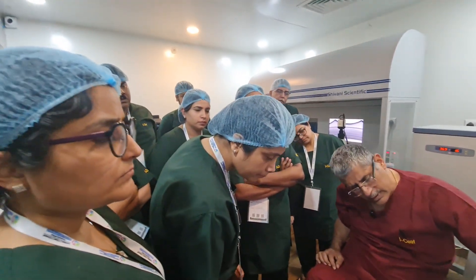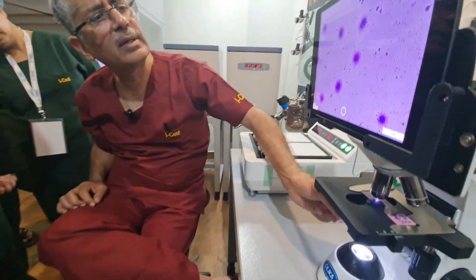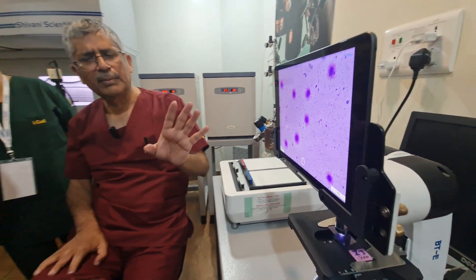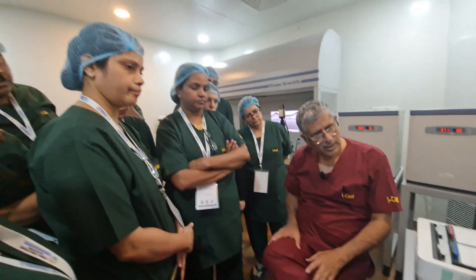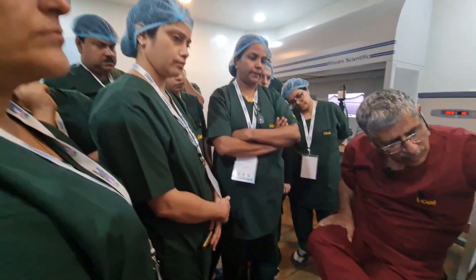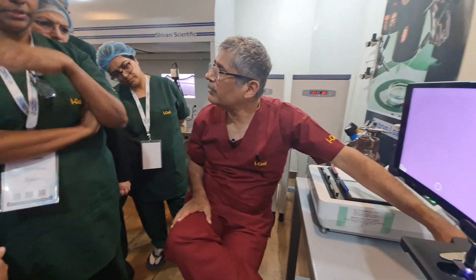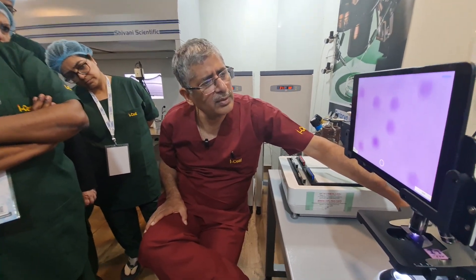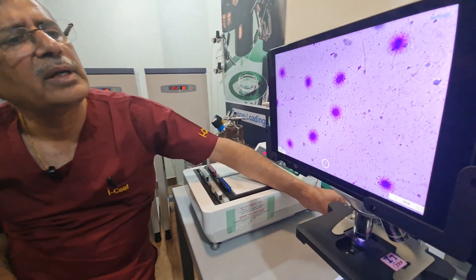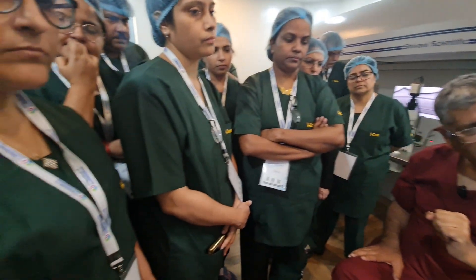You know you have to adjust, but companies will adjust and give it to you. You can also do it yourself, but don't touch this unless needed. You can also adjust for more contrast using the contrast control — it is up to you. Once you set it up for a particular microscope, we don't touch it. There is a coarse control and a fine control. The coarse control will make the image disappear very quickly, so don't go for the coarse control once you've set it up — then go to the fine control and never touch it.